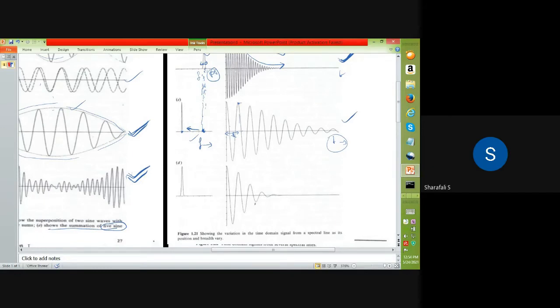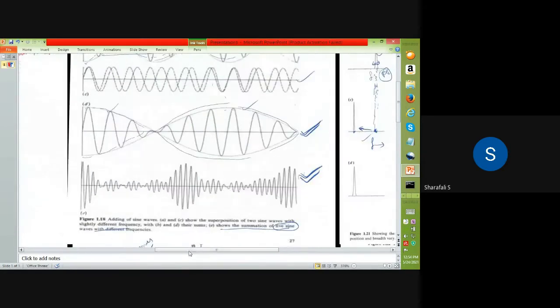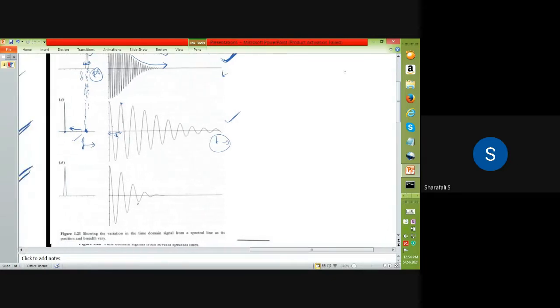Also you have to remember that all we are representing is in time. So when you take the inverse, whichever has the larger time period will have the smaller frequency.